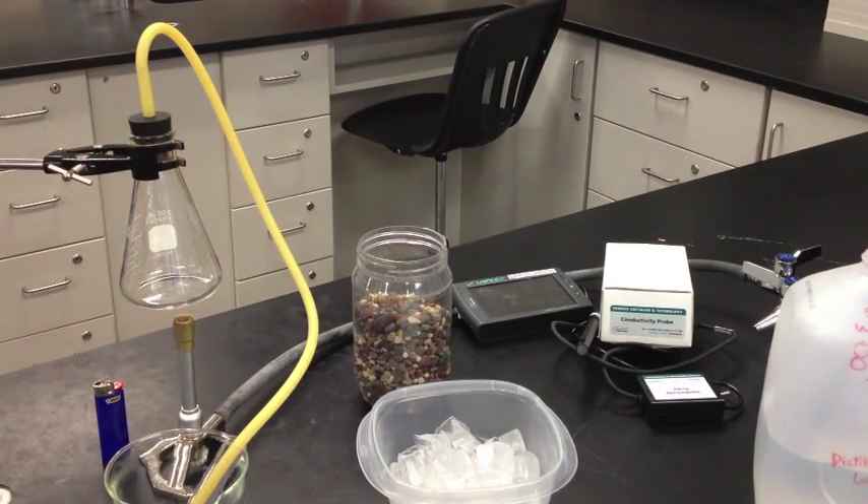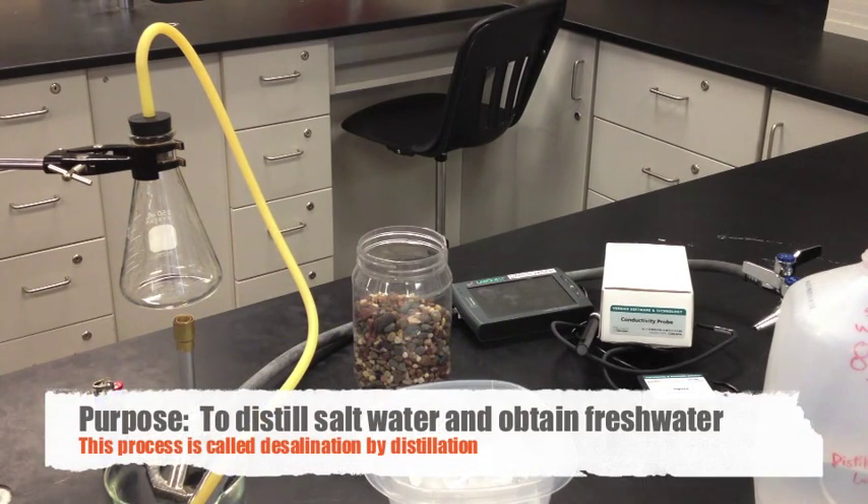So can we take saltwater and turn it into fresh water? That's the purpose and objective of this lab — to take saltwater and run it through a process called distillation, and distill it into fresh water.